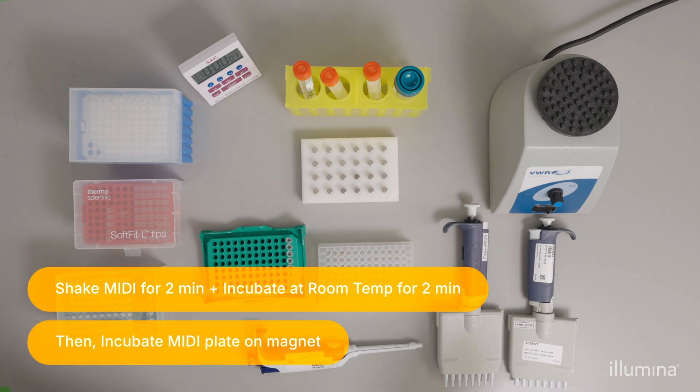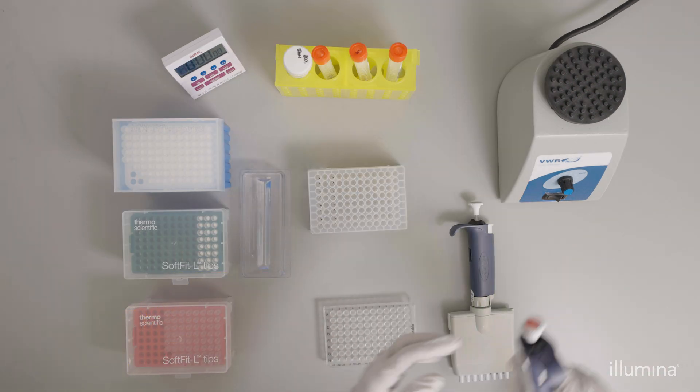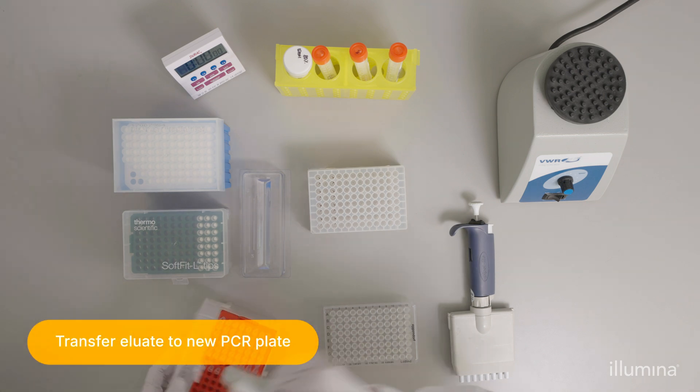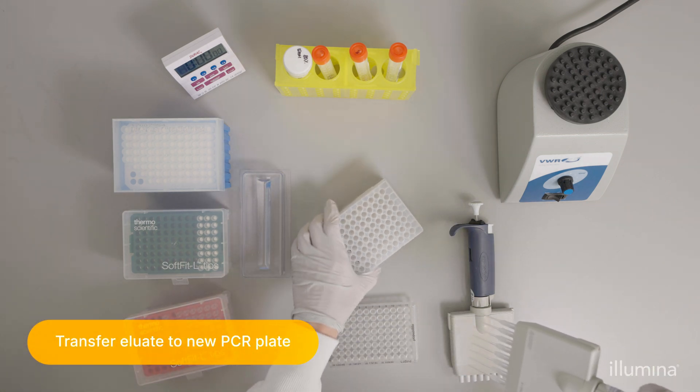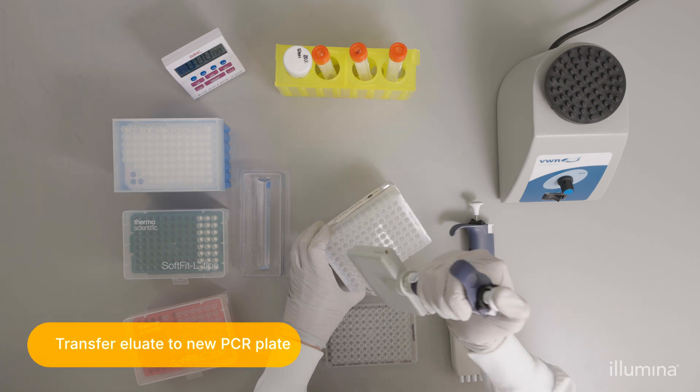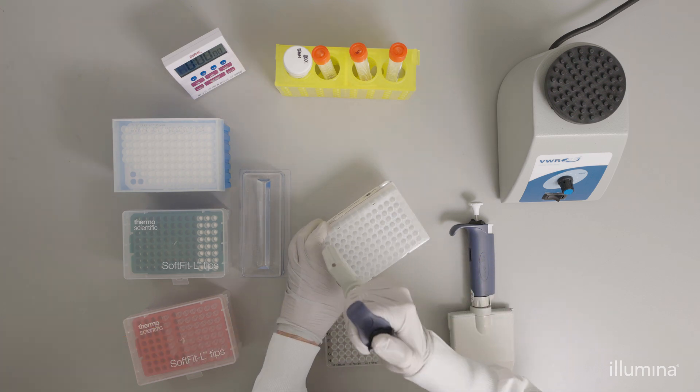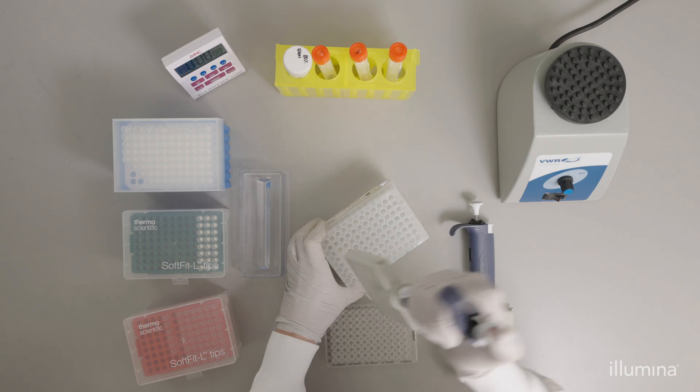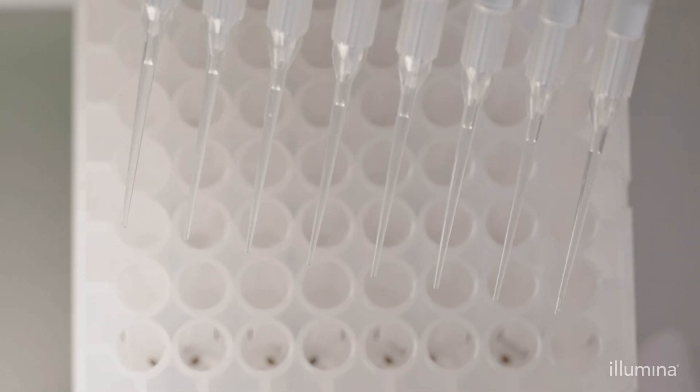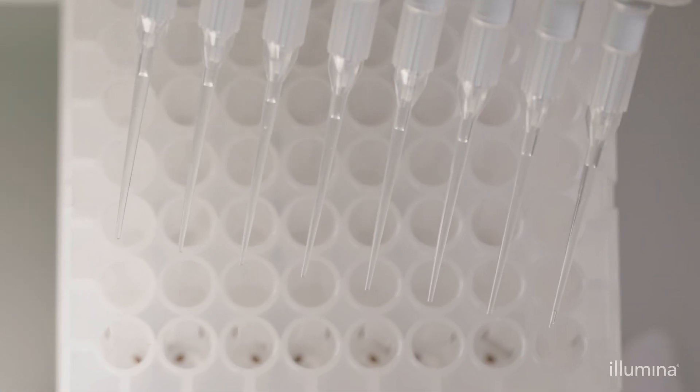Incubate on the magnet for the time according to the protocol. After incubation is complete, transfer the eluate to the corresponding wells of a new 96-well PCR plate using a 20 microliter multi-channel pipette. Check the tips for equal volume during transfer.